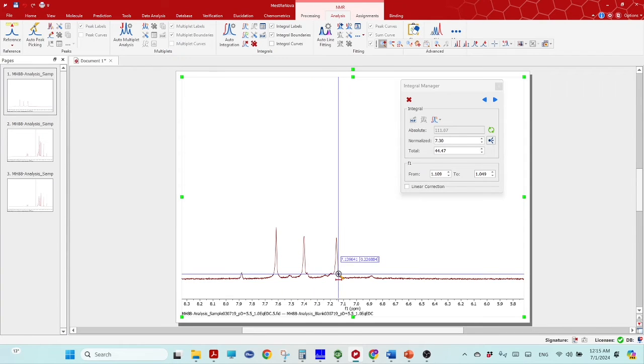But you can see these protons have something already forming in the reaction, so it is tough to integrate and get a good estimation. Mostly this peak is kind of clean, better than the other two, so we can integrate this peak and get the concentration of that acid.